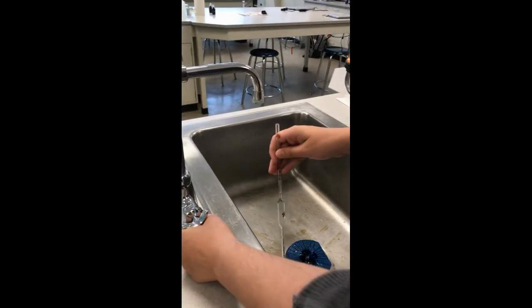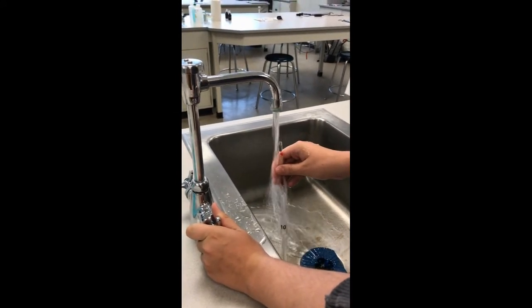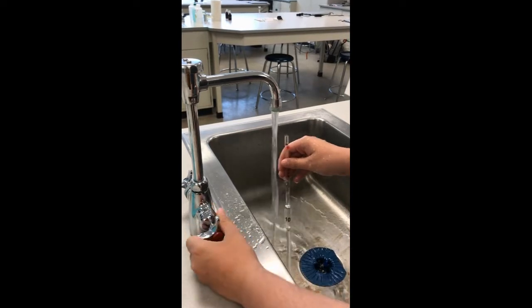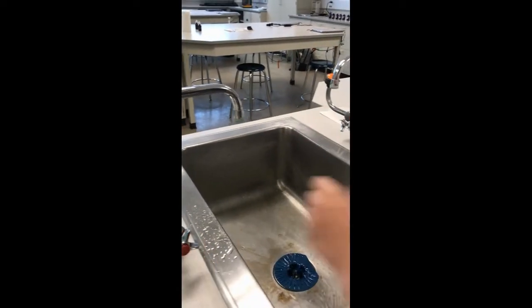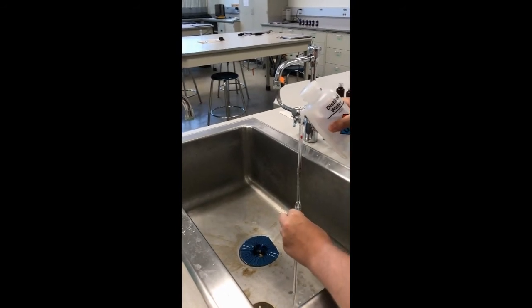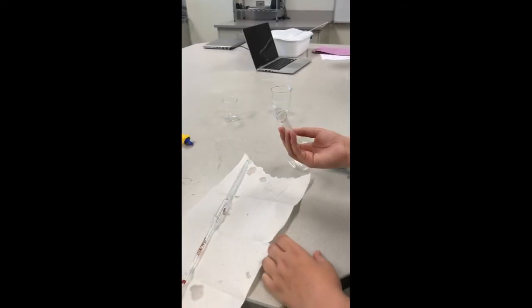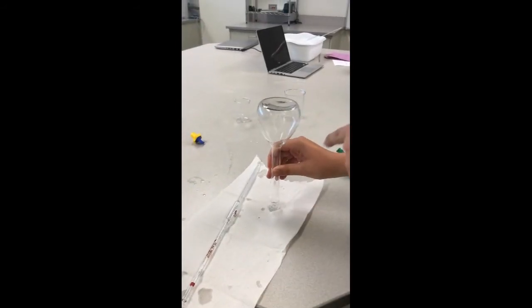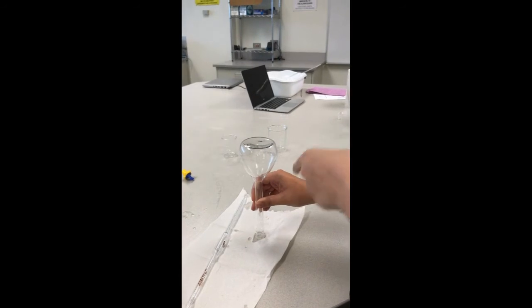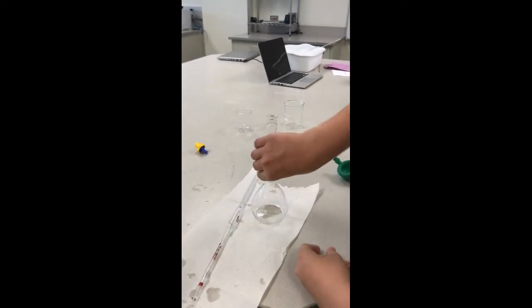To clean out the volumetric pipettes, you can use the tap water if the sink is large enough, and do a final rinse with DI. Make sure to never leave it to dry like this, or it could fall over and break and you're $20 in debt.